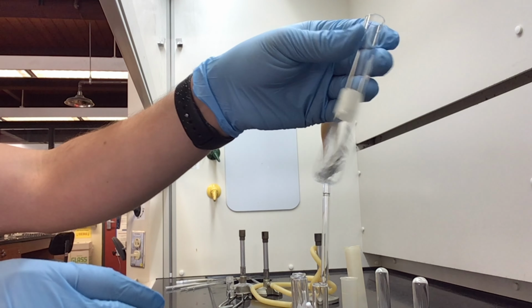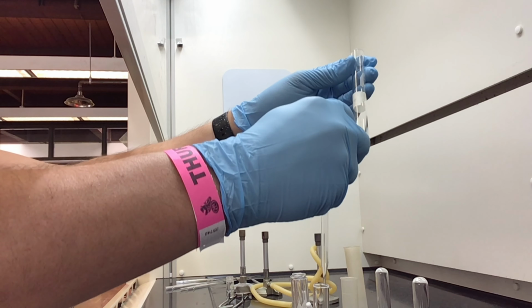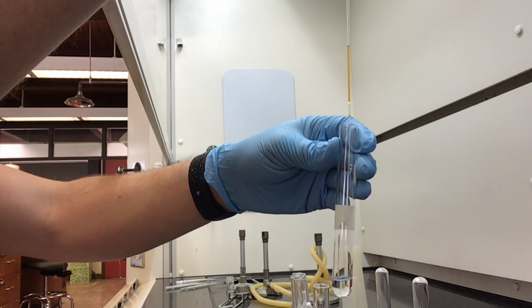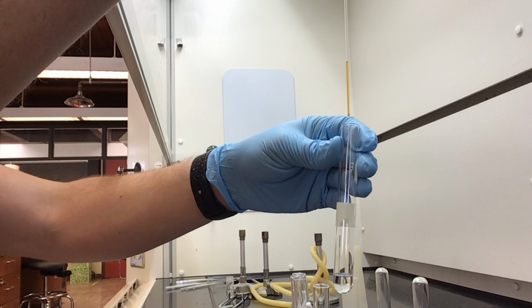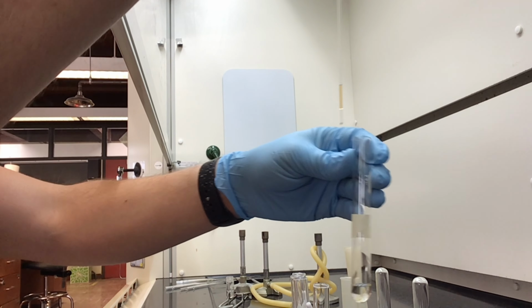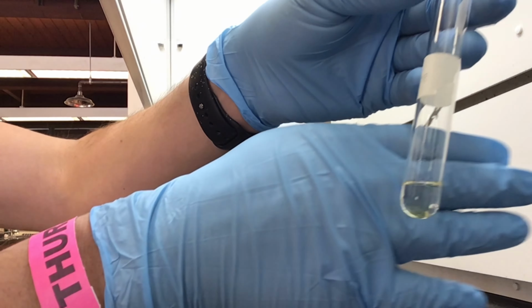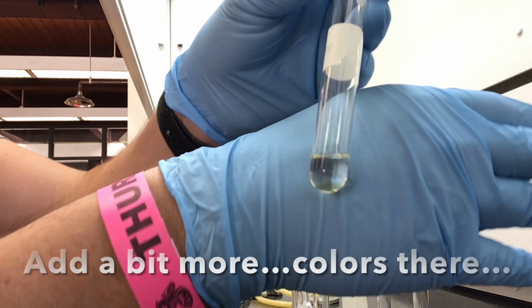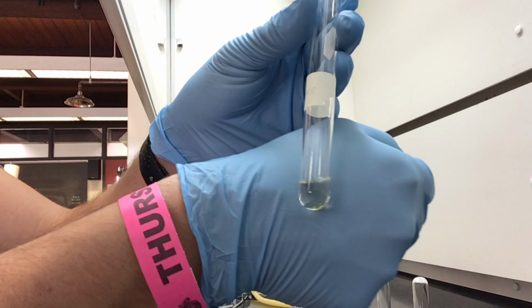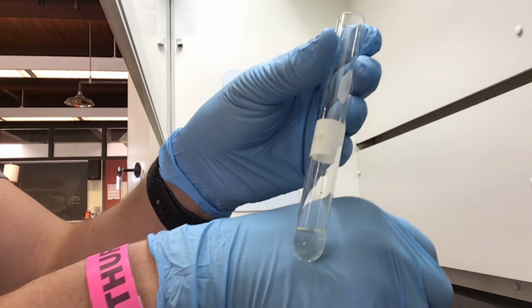There you go. All right, so as you can see, these tests are really easy. The only thing you really need to keep an eye out for is adding too much initially, right? So like I said, methylene chloride can straight up jump out of that pipette and you'll add more than the couple drops that you want. And then if you've added too much and it's reacted or completely consumed your unknown material, then you won't get the proper reading, okay? So just be careful, that's it.